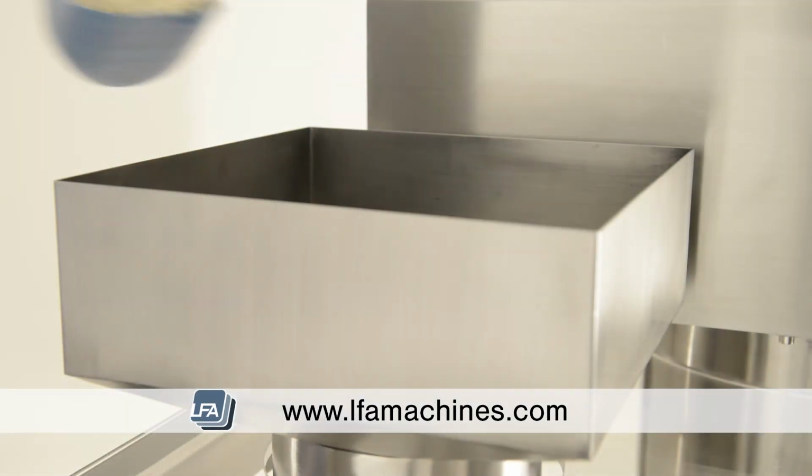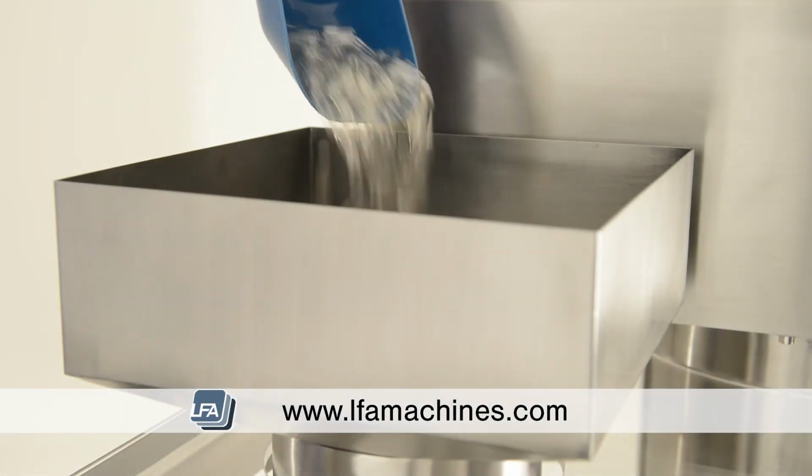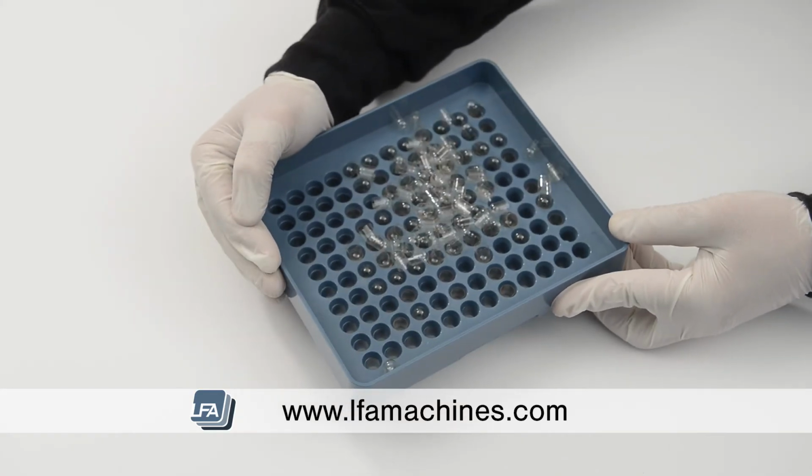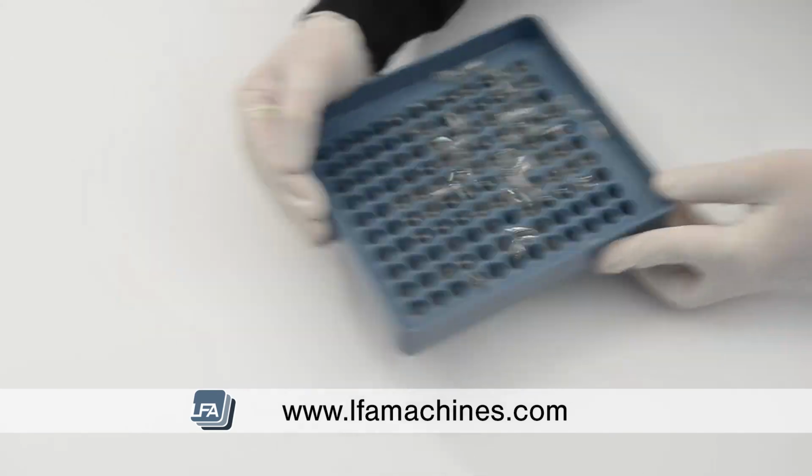Capsules tend to have a shorter life compared to tablets, whilst the capsules themselves are both sensitive to heat and moisture, meaning they have to be stored in a specific way to ensure they don't deteriorate.